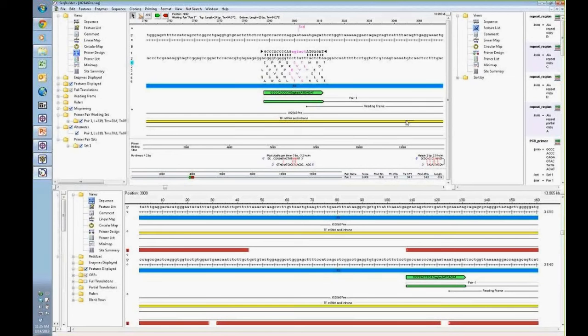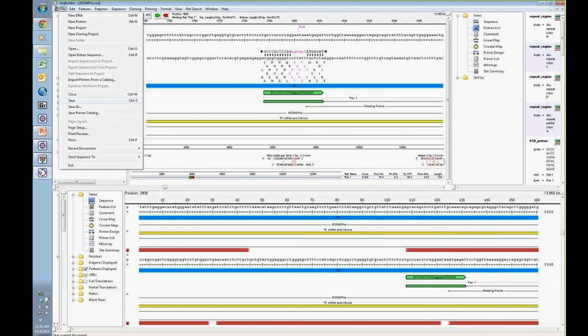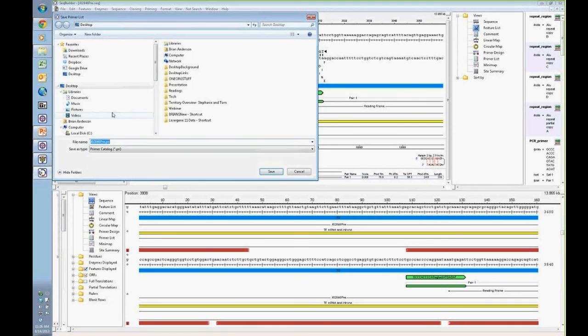The next step is we've added those appropriate enzyme sites onto the ends of our primers, and now we're going to in silico amplify this to create an amplified clone. One question that you may have here is, if you want to save these primers and export them out, on the left-hand side here we have a folder that says Primer Pair Working Set. Expanding any of these, you also have the option to save as a primer catalog. So I can save it as a .pri file, or I can export this as a FASTA or a text file for further downstream use.